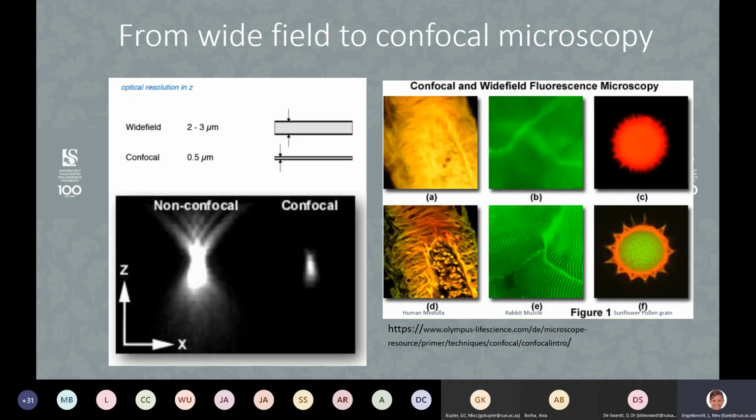So your wide field microscopes are the ones that you might have in your lab. The difference between them is basically that you would see much more detail with a confocal, and you can actually do optical sectioning. In a course that we will present in a few months on confocal specifically, we can explain how we get to these types of images instead of those wide field microscope images. But just to give you an idea where super resolution comes in, from a wide field microscope, your point spread function includes all the out of focus light as well. A confocal microscope eliminates anything that is not in focus. The bottom and the top part of the point spread function is excluded.